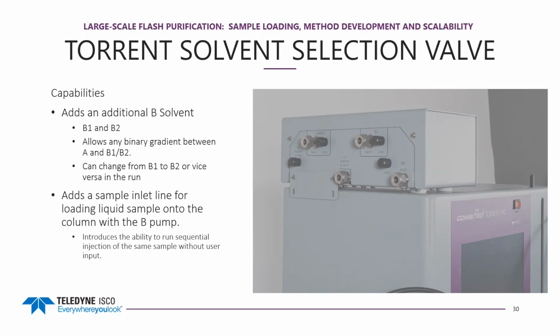And it also adds a sample inlet line for liquid loading sample into the column using the B pump. And so this introduces the ability to run sequential injection of the same sample without user input.